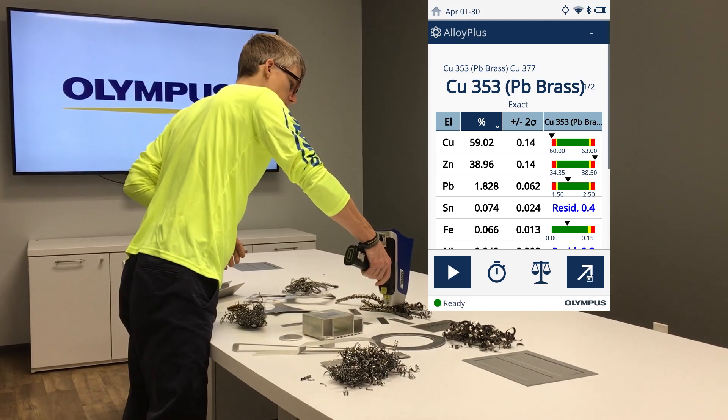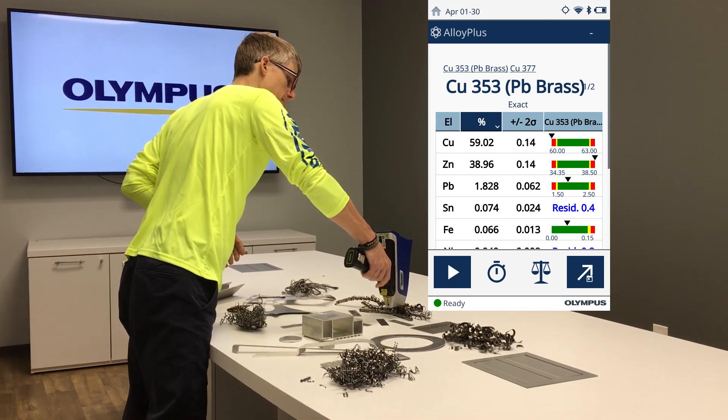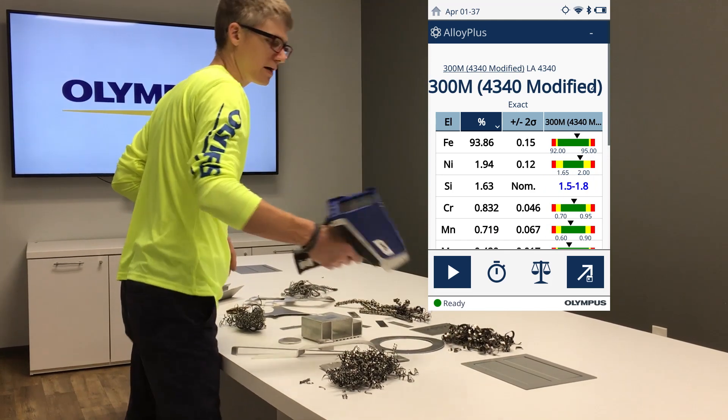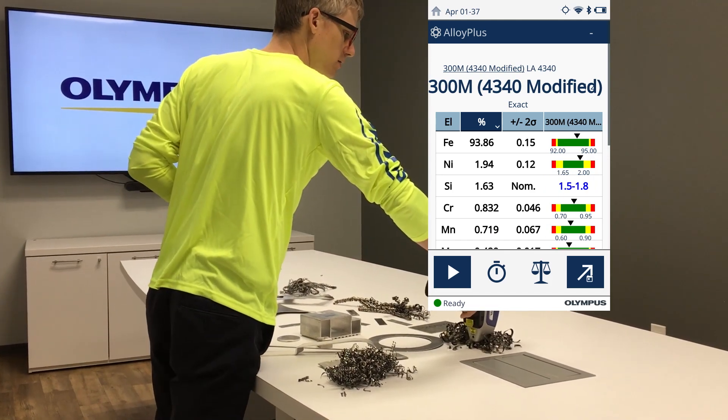We can do turnings as well. This is a proprietary grade — 300M, 4340 modified. No problem. It's already in our QuickSort grade library.